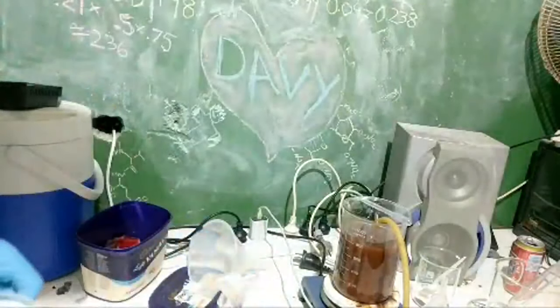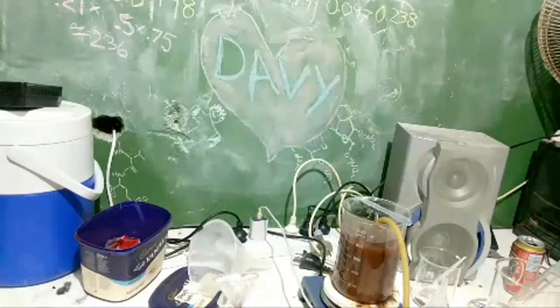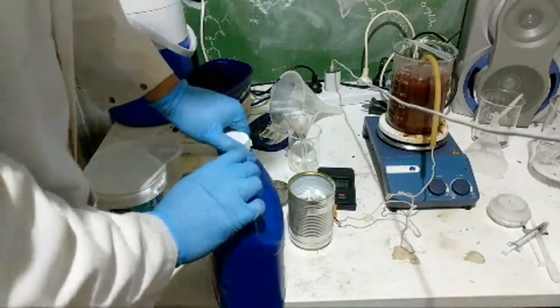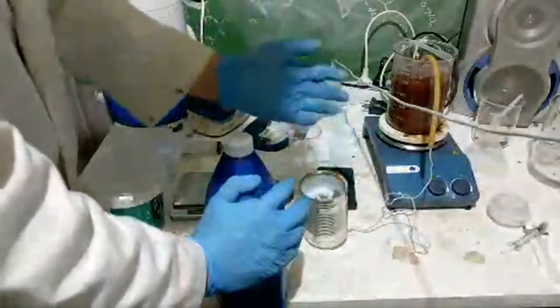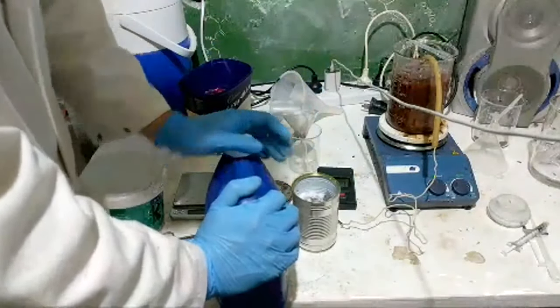What do people think of this nitrate to iron ratio? Oh, I forgot the hydroxide. I think that's a good suggestion. I've got some sodium hydroxide. It's 1 to 2. The stoichiometry is great and all, but when you do it like this, surely it doesn't matter. Do people agree? Surely the ratio isn't going to matter when it's so inhomogeneous.